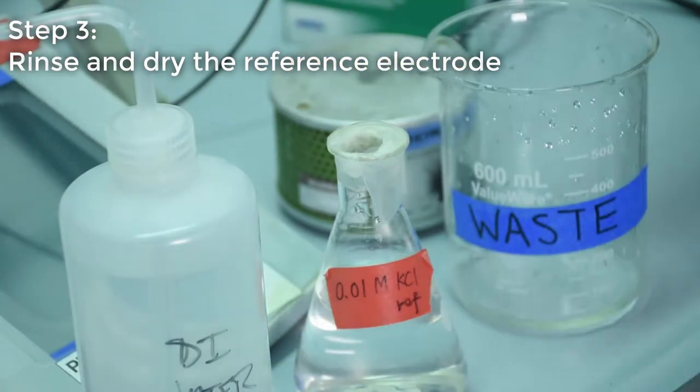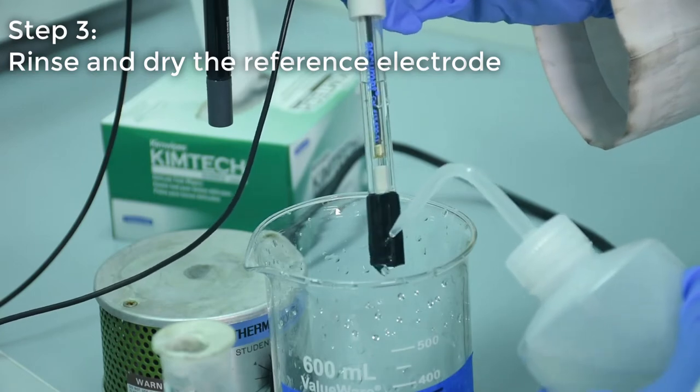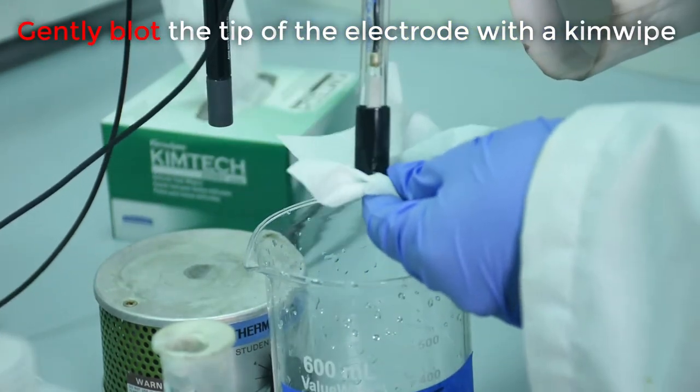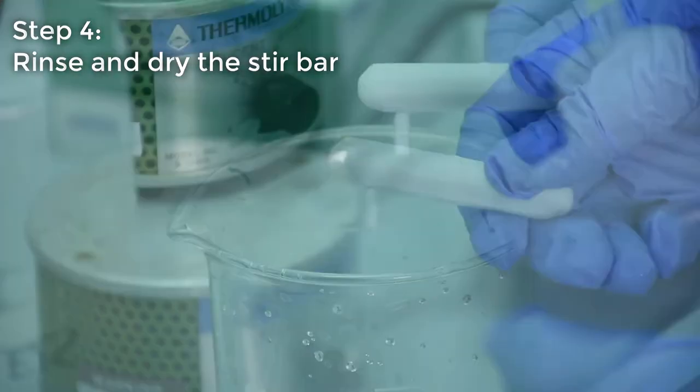Following the same rinsing step, rinse the reference electrode with deionized water and gently blot the tip with a chem wipe. Also, rinse and dry the stir bar.